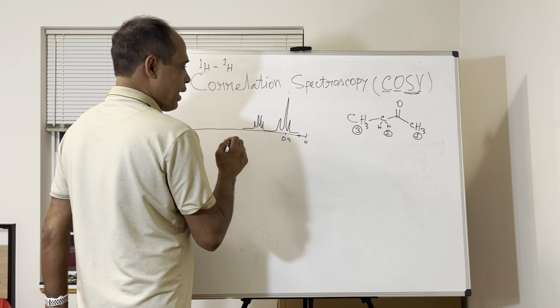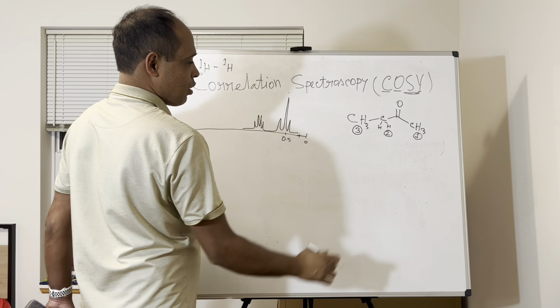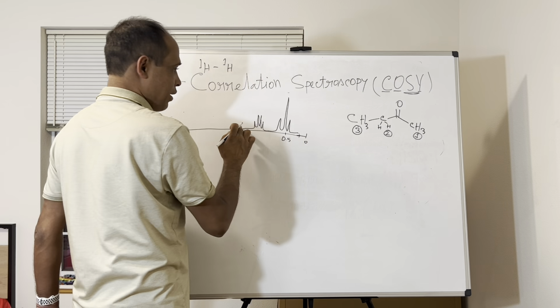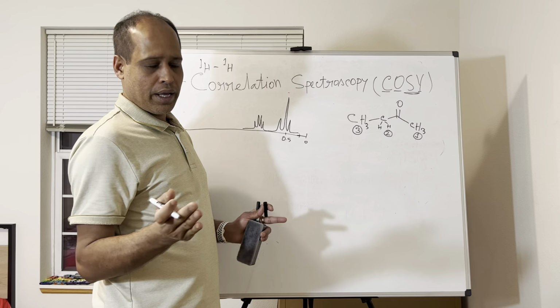This CH3 is also next to the carbonyl, so it will be nearby, and it doesn't have any neighbor protons, so it will not show any splitting.